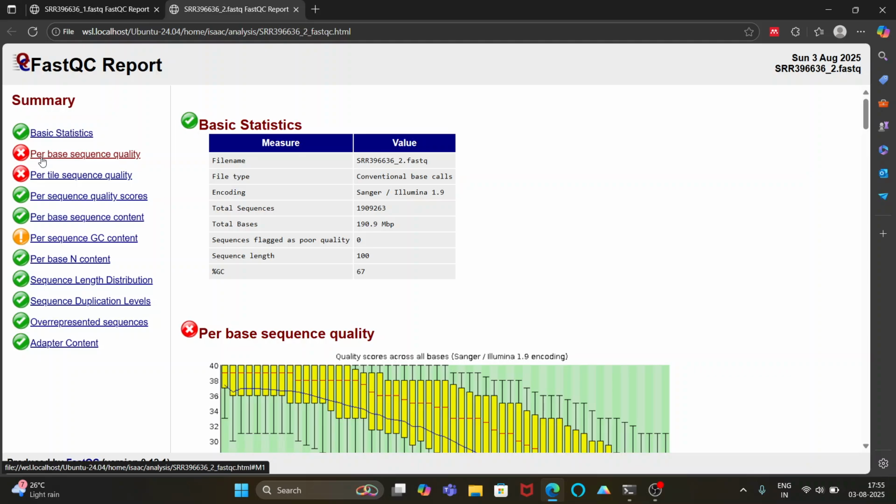But in order to do an SNP analysis, because they have done an SNP analysis, much of the reads need to be preserved. But for the continuation of the training and everything, I think we can go for trimming as well as quality control of the reads and see what we get.